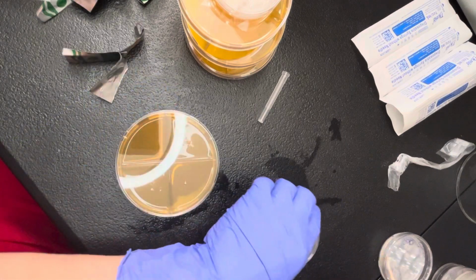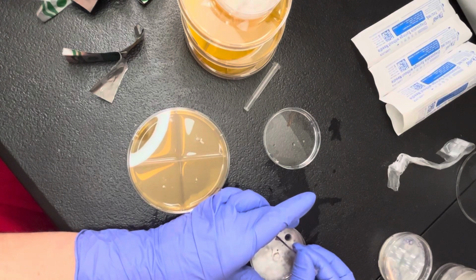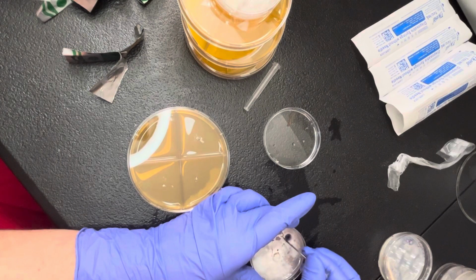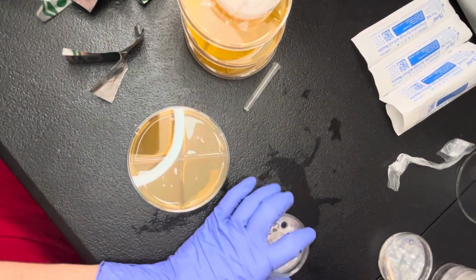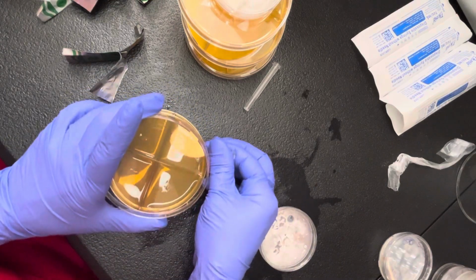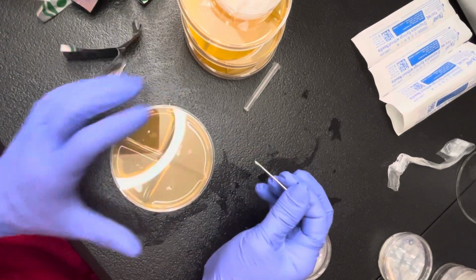If you are thinking to yourself, oh, I wonder if I could just use these plates for multiple strains, I wouldn't suggest that. I have some of these plates where the mycelium is growing up over the edge. So I personally wouldn't recommend that. If your plate starts to fruit, it can spore. It's just better to do the same isolation or strain on the same plate.